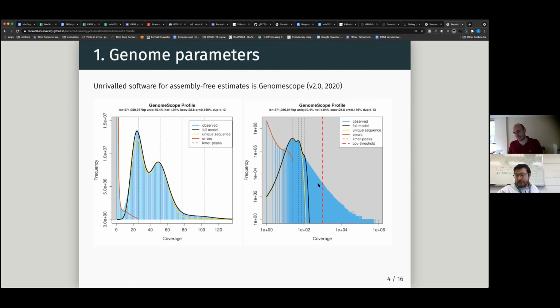So here to the right, you have basically what happens when you start to go beyond 120. You can see that the axes were log scaled, so you have these weird compressions of the curves. The one that is going down rapidly goes up because we're close to zero in log scale. And the difference between these two becomes less pronounced. Of course, in this case, it's not really good to estimate the parameters, but that's not what this plot is for.